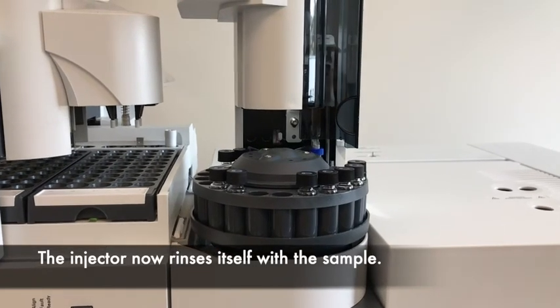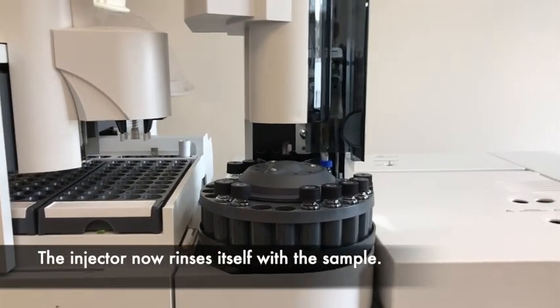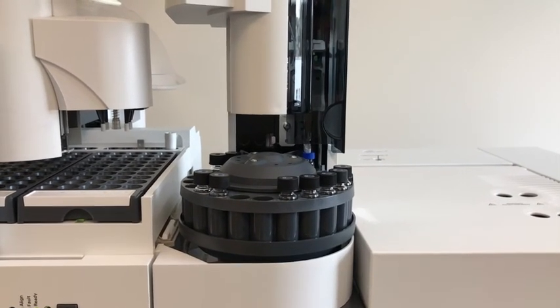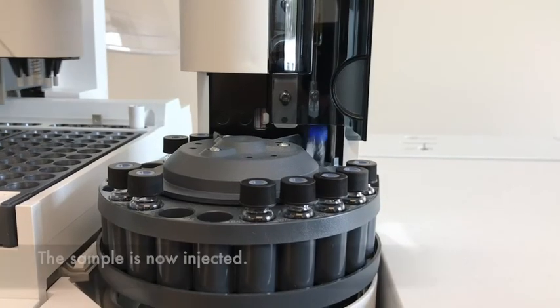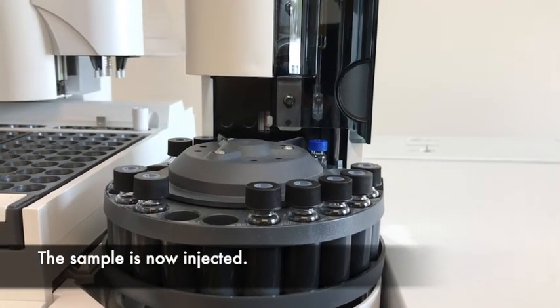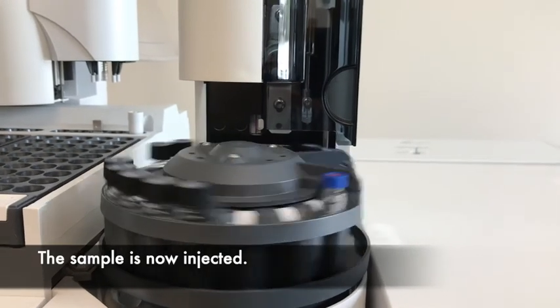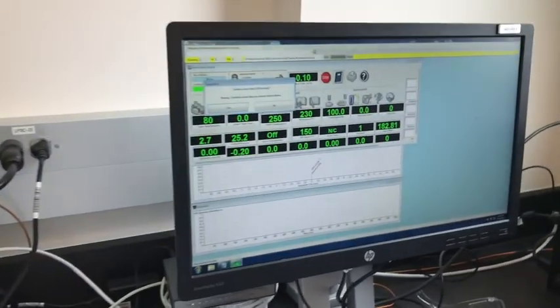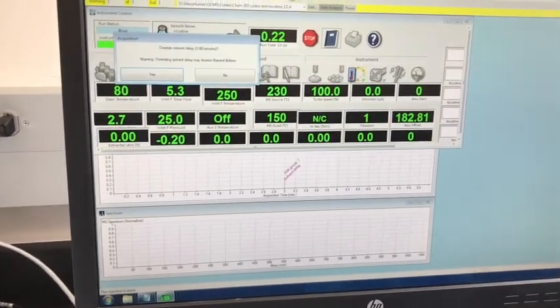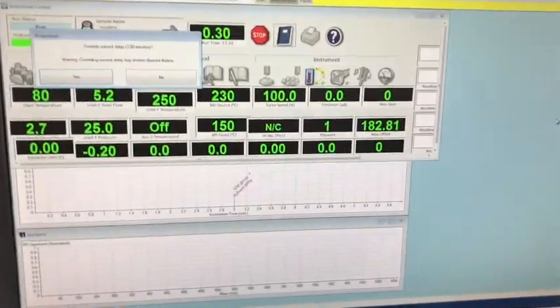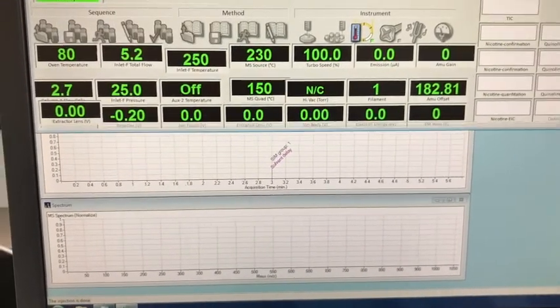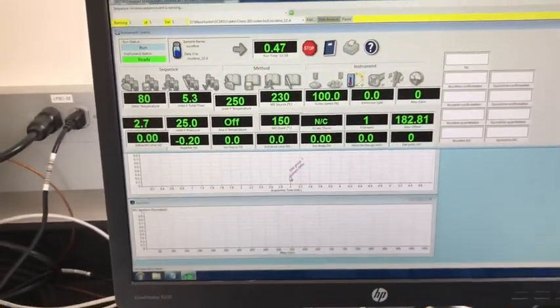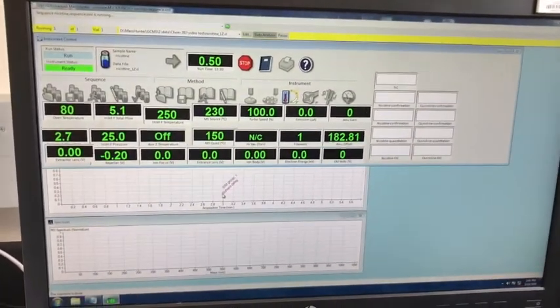The auto sampler does a couple of rinses with different solvents and rinses in the sample before it can inject. And that's it — it has injected the sample. We have a 3-minute delay before the samples come out. This is to make sure that the mass spec is not overloaded with the solvents. So only after 3 minutes will we be able to see anything coming out from the GC column.